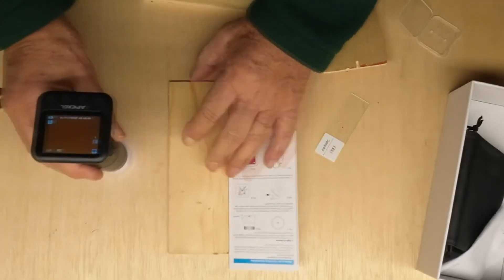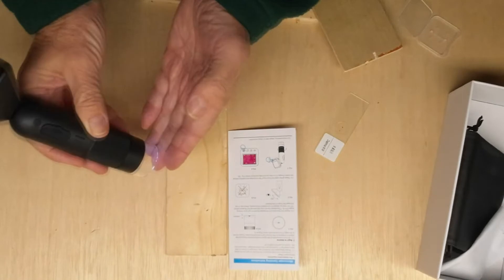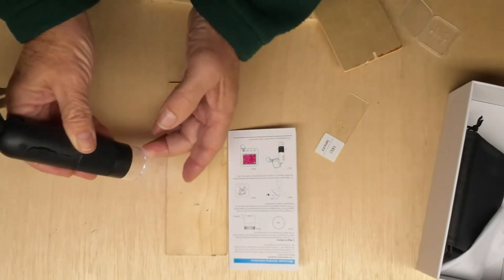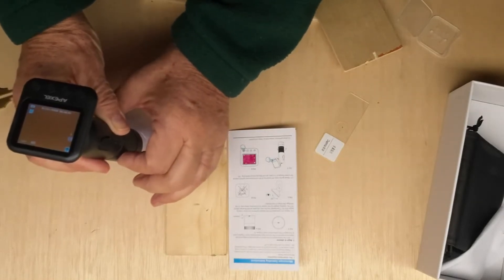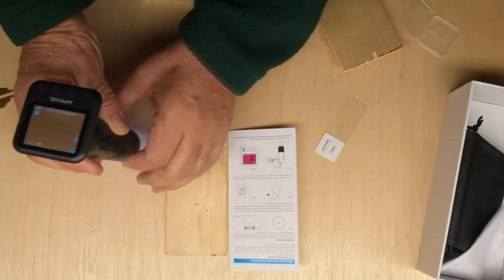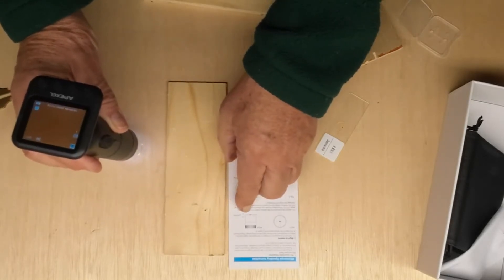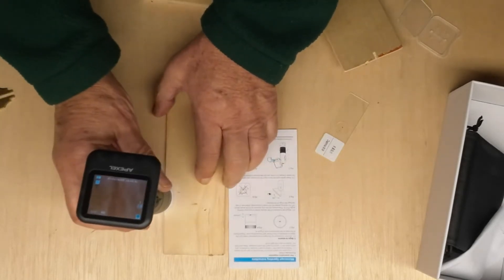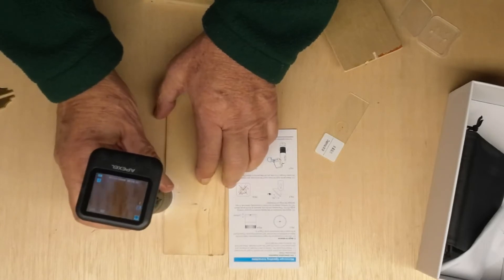I was curious as to how far away you could have the glass or plastic piece here and still be able to focus. I've moved it out to its maximum focal distance and experimented with a few things. It says it needs to be about four millimeters plus or minus, and what I found was that this piece of wood was just the thickness that would still focus nicely.